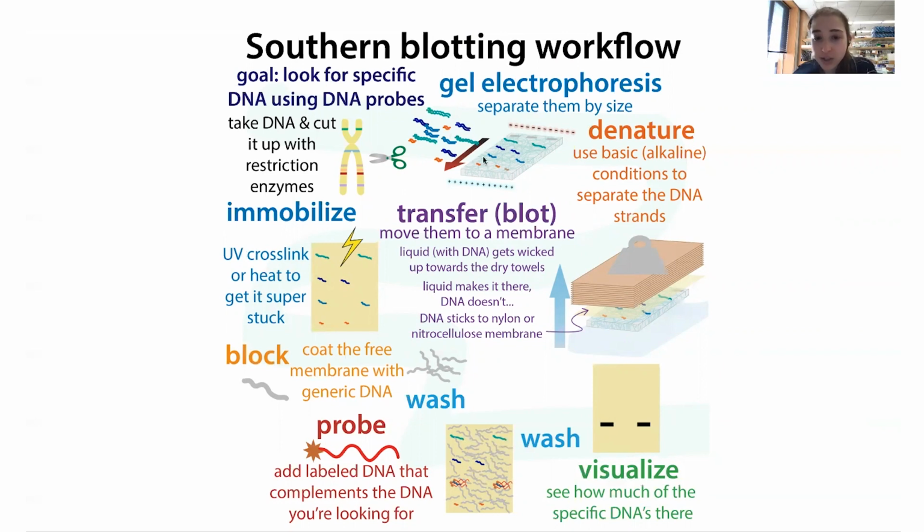Some of them do it in the gel, so you use an alkaline gel. Some of them you soak the gel after you've run it in a basic solution. Others, you soak the membrane in a basic solution, often something like NaOH. And then these steps have a neutralization step where you add acid, not a strong acid, but enough to neutralize the solution before you move forward.